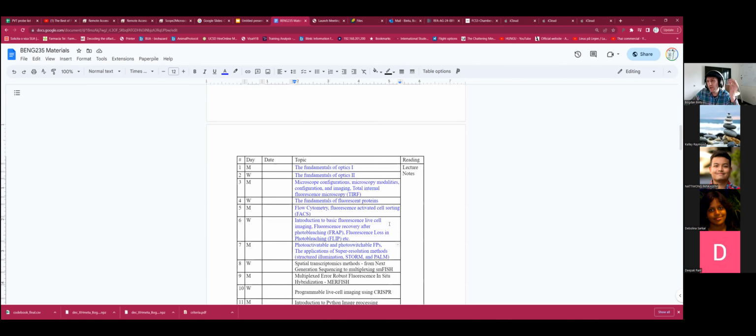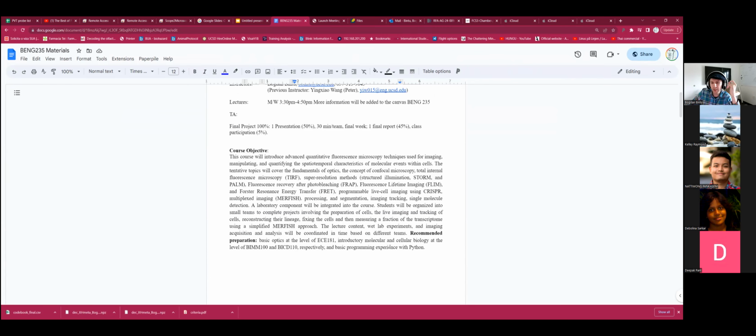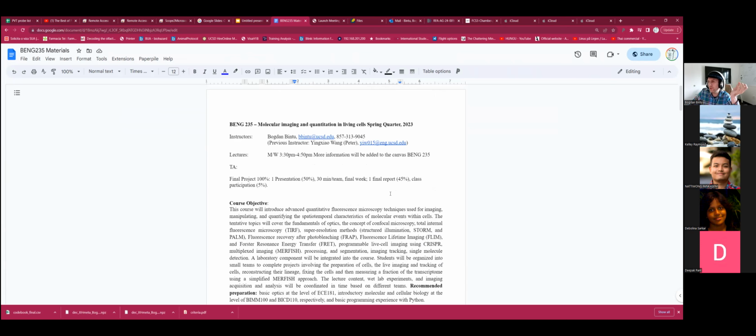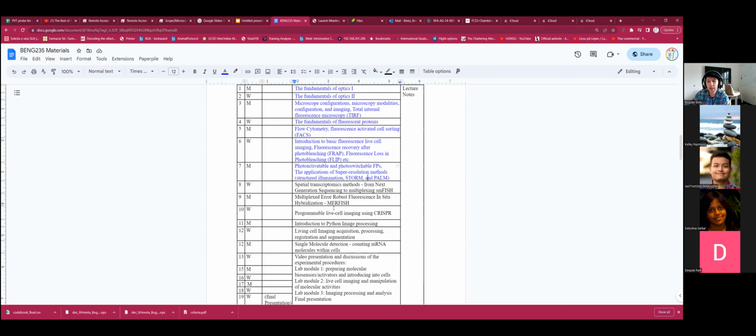Now, where it's going to separate from the course last year is the focus is not going to be only on live imaging. One of the very interesting directions that is currently emerging, particularly with the advent of large and powerful neural networks, is this interface between doing some type of imaging in live samples, fixing those samples, doing a whole collection of other measurements in the fixed samples with even more powerful modalities that weren't previously possible, and then integrating this data and enhancing both datasets. Because I think that's a super important direction that is now flourishing, I'm thinking of having some of that in the course. So in other words, I'll be talking about how to extract a lot of information from core images.